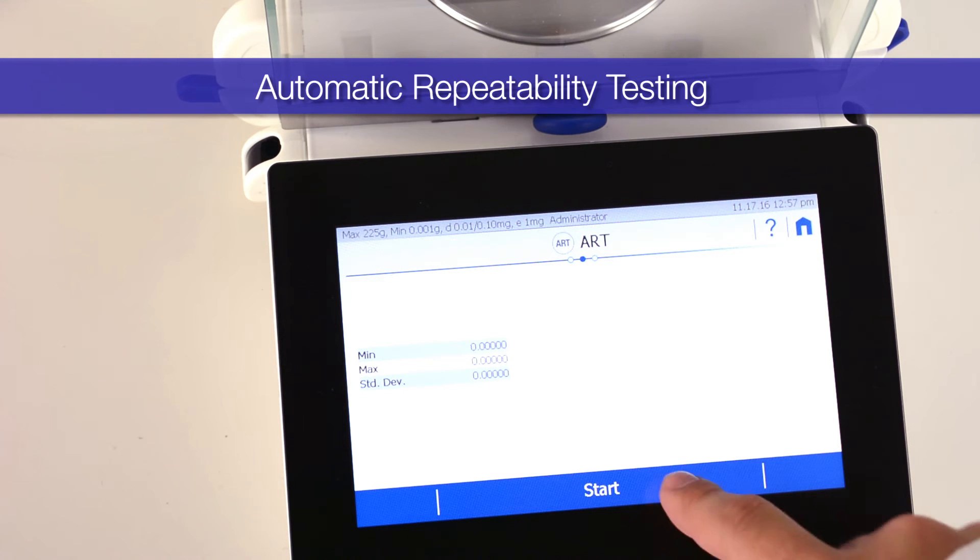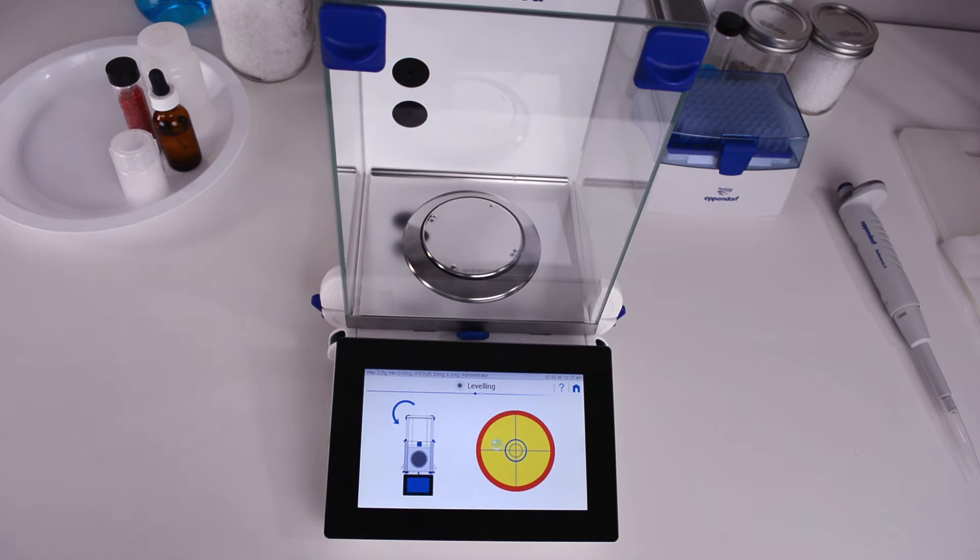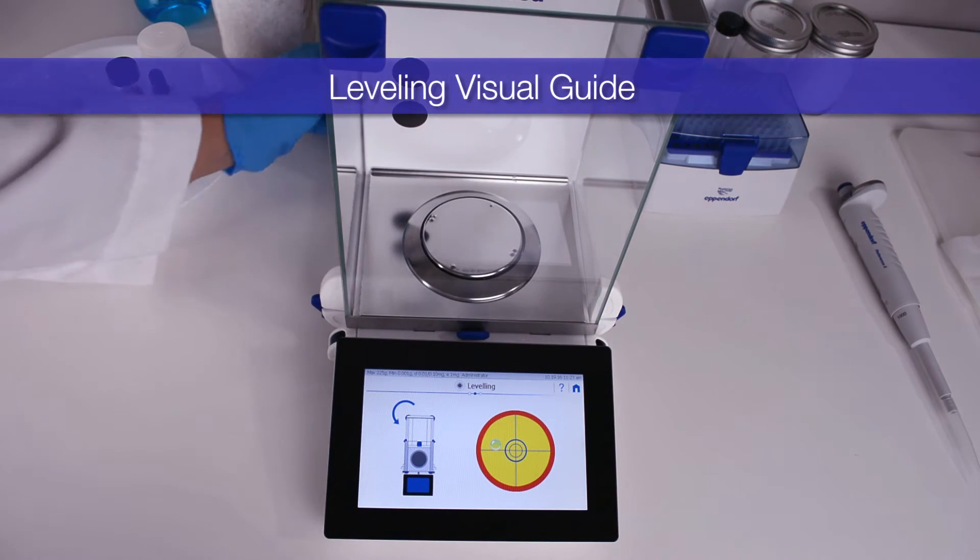Leveling has a visual aid instructing you on which foot needs to be moved and even in which direction to achieve a perfectly level balance.